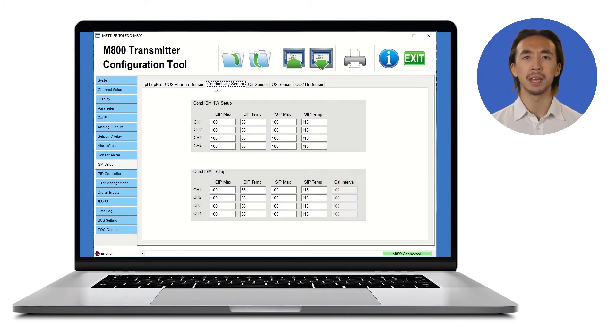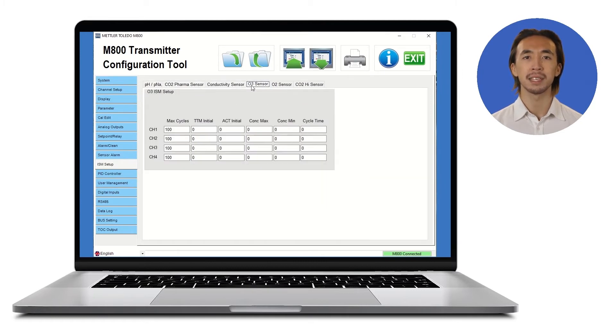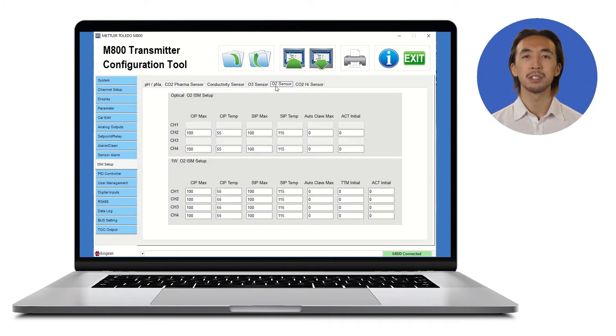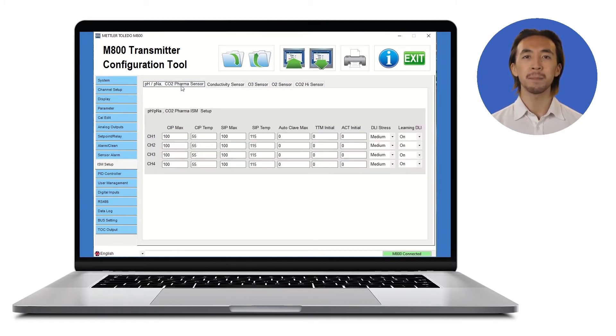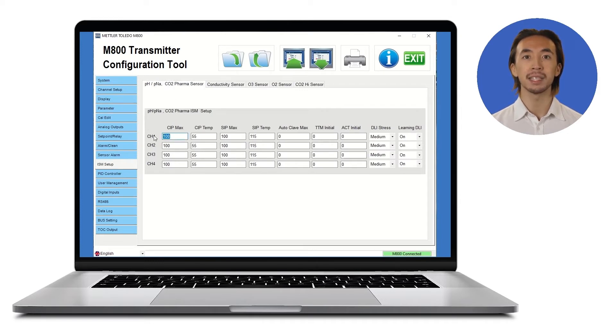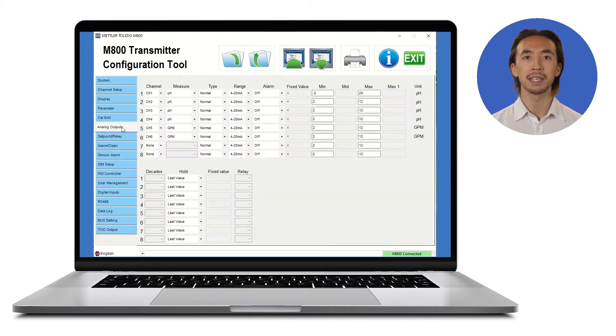Conveniently set up how your ISM sensor's diagnostics trigger alarms based on CIP counts, the adaptive calibration timer, and the dynamic lifetime indicator.